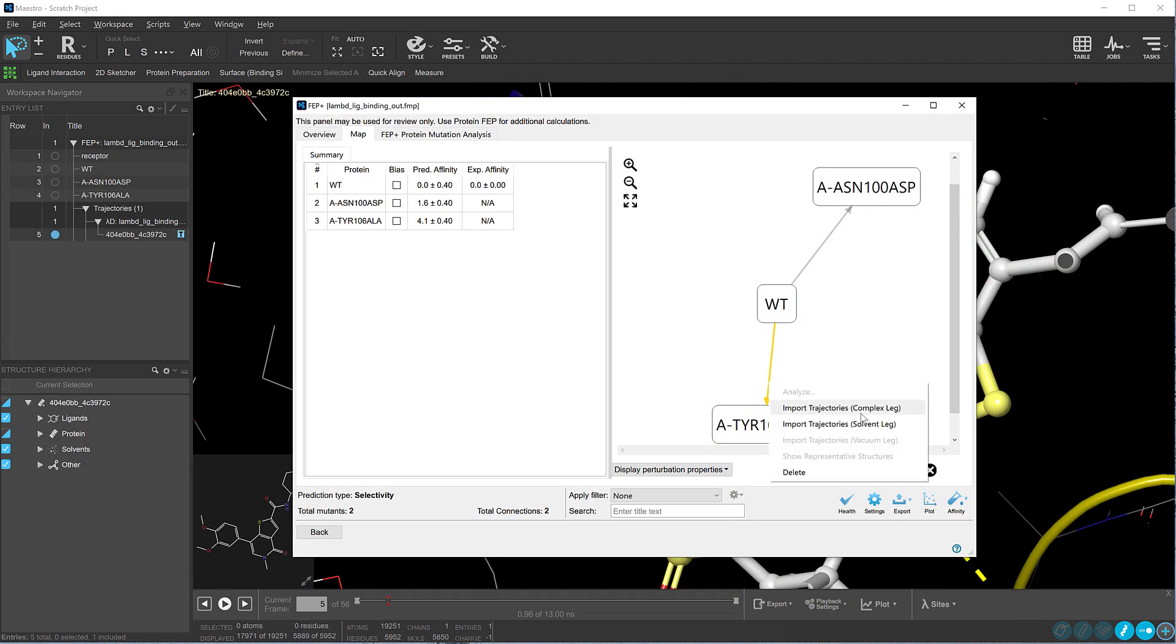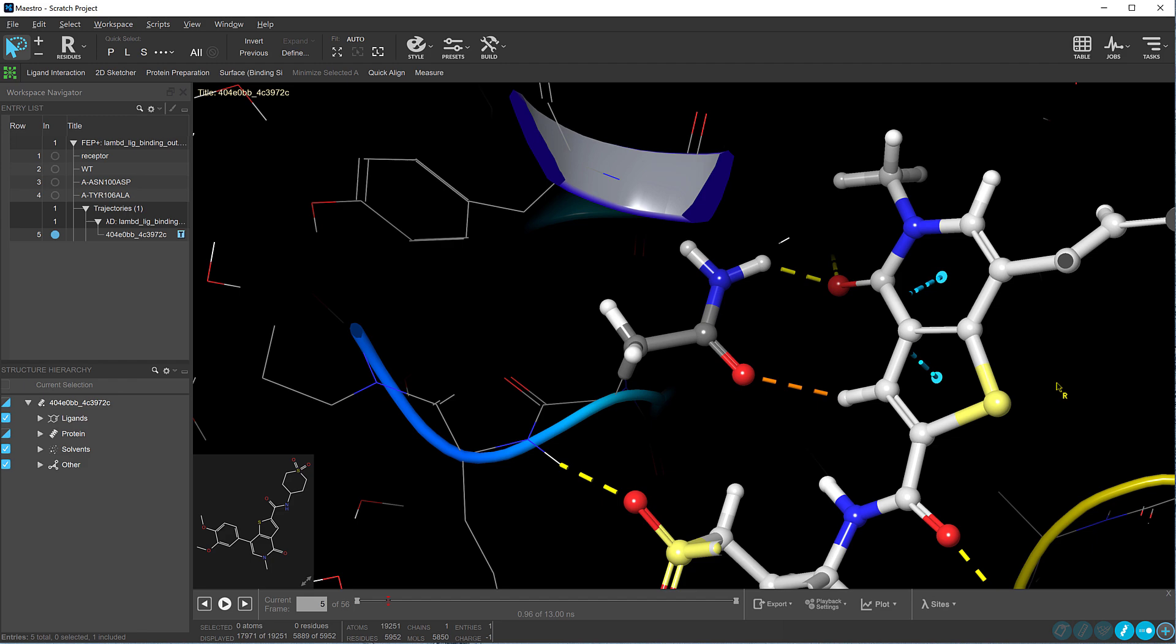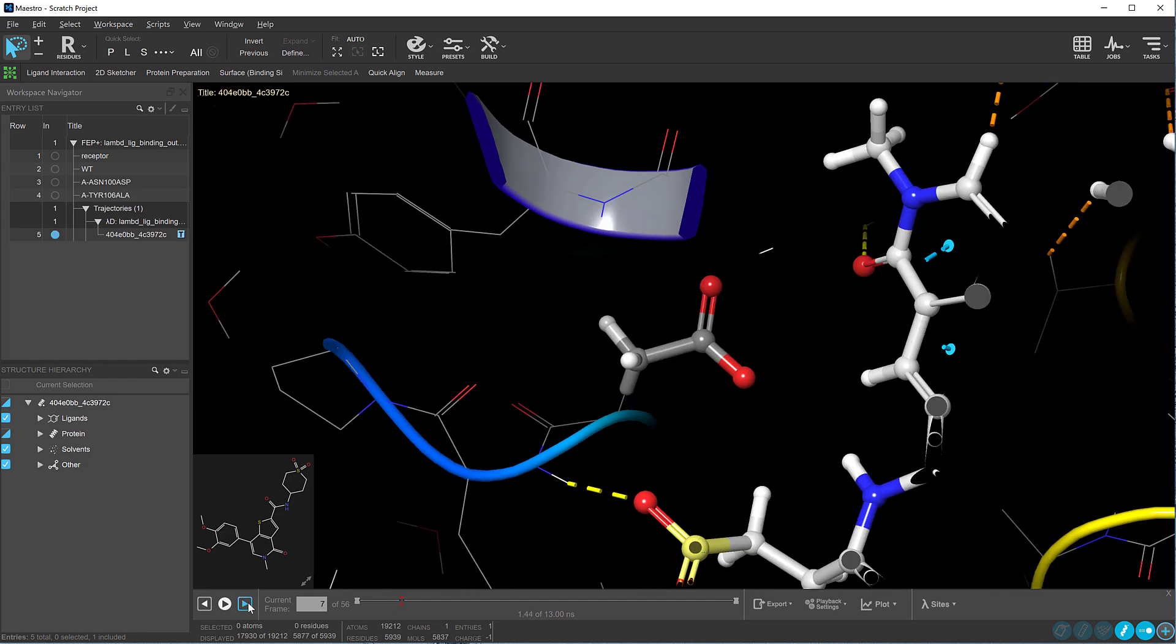FEP plus residue scanning now generates structure output that can be viewed within Maestro.